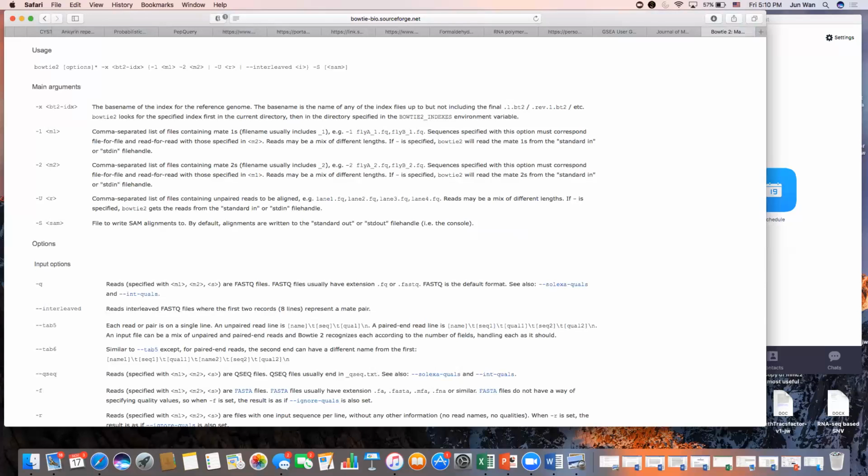It gave me fits while I was trying to do this. And I want you guys to have a nice, smooth transition. So I'll explain some of the issues that came up when I was working with Bowtie 2, because I went several ways to do this index. But what you'll see here is the program name, step 1.